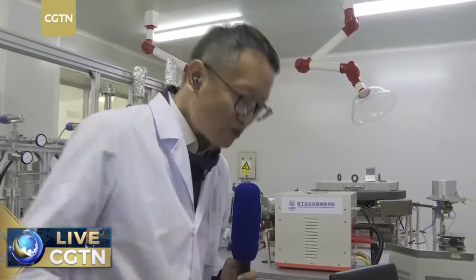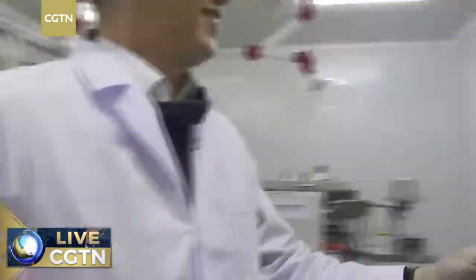So could you also introduce to us what kind of devices you usually use in this laboratory? The environment is somewhat cold because the operating condition of the instrument needs a low temperature. The instrument is a noble gas mass spectrometer, and I have been in this laboratory for 10 years.